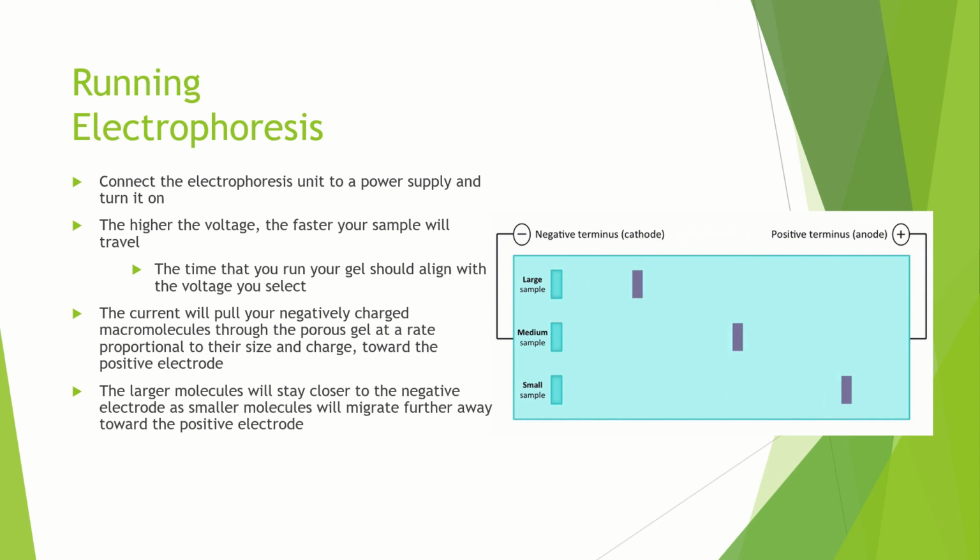As you can see, the smallest molecules move much faster. When the desired time has passed, you can turn the power off and you're ready to observe and analyze your results.